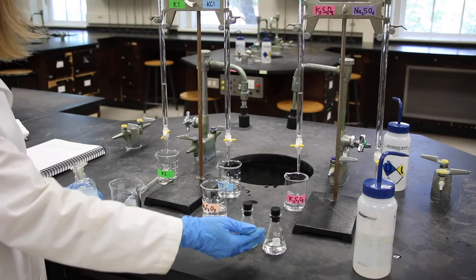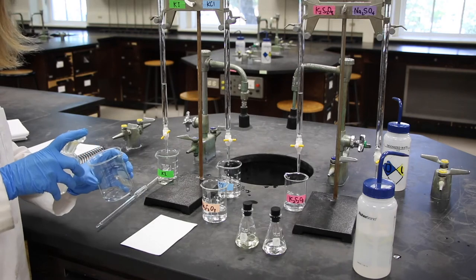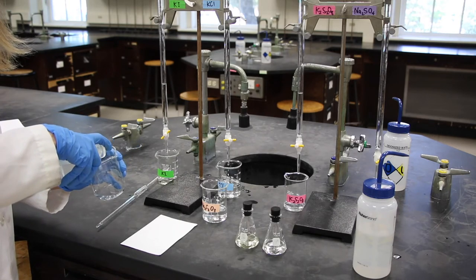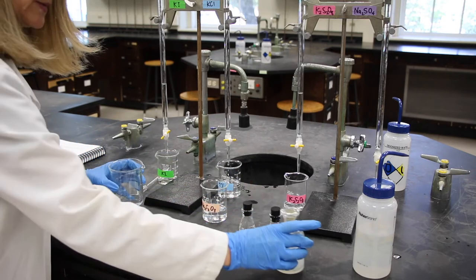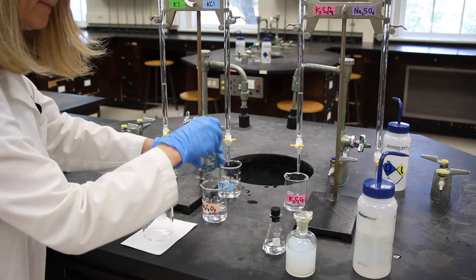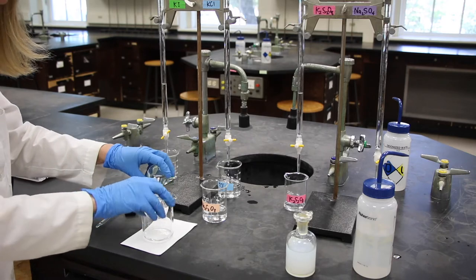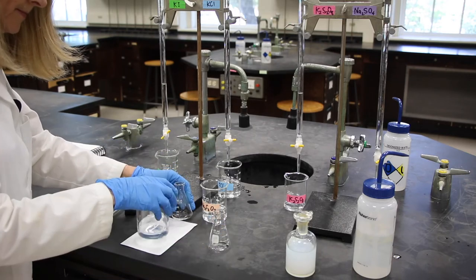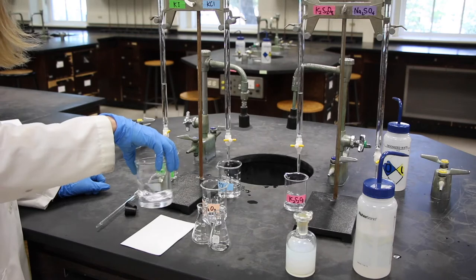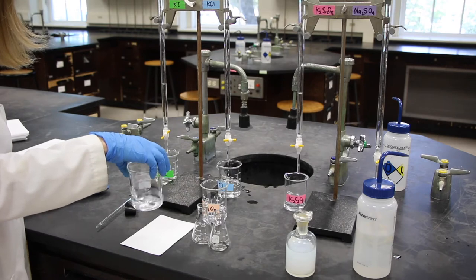For solution two, we've already drained our solutions that we needed to our flasks A and B, and I've put 10 milliliters of the sodium thiosulfate, and then I just put starch in my beaker. Okay, get ready to time. Now, since we changed our concentrations, I'm going to expect a different time for the reaction.